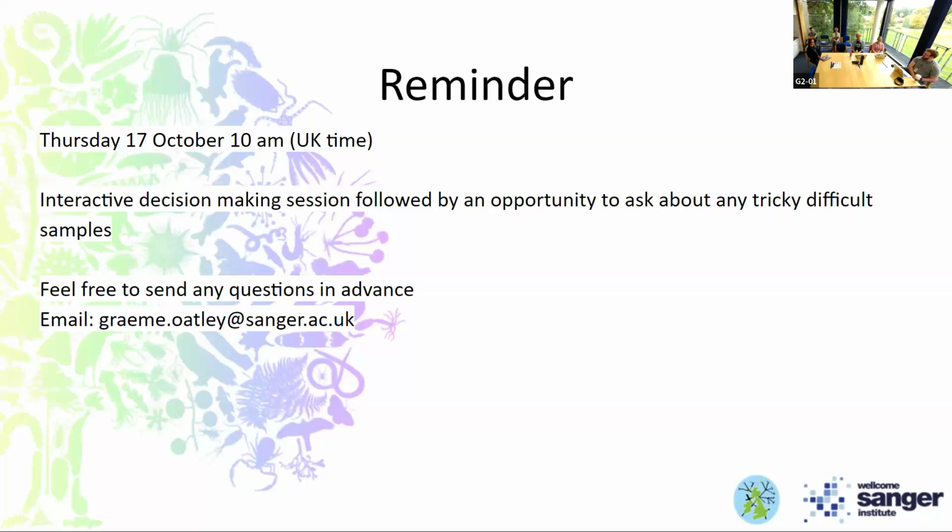But yeah, I think figuring out what the problem is you need to solve is the first thing, and then seeing if we can develop a good experimental design to test or fix that problem. Then having the right samples to try it on as well.